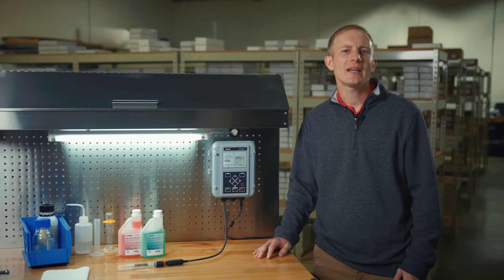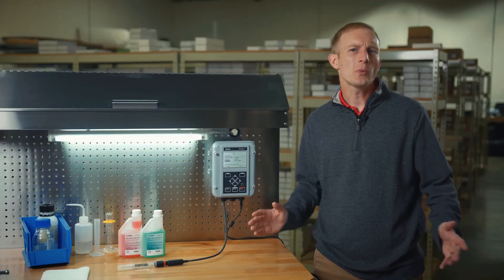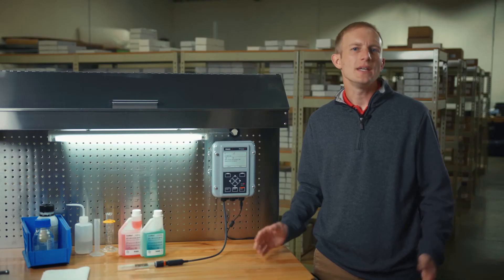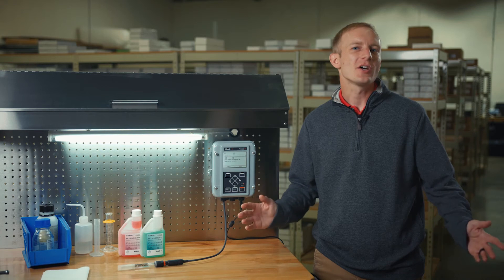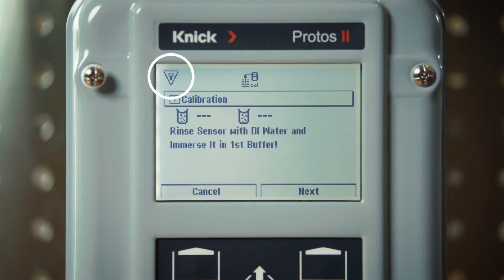We will select the KINIC CALMAT buffers and press enter to continue. Once we are ready to perform our calibration process, we will select the next button and move to the first steps. As you can see, once the calibration process begins, the transmitter enters a hold mode holding the output to the control system. This is also indicated by the wrench icon in the top left corner of our display.